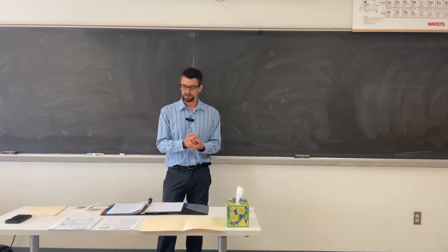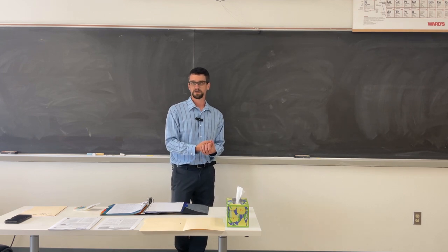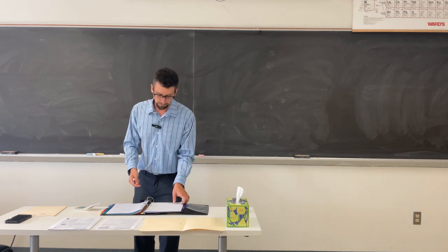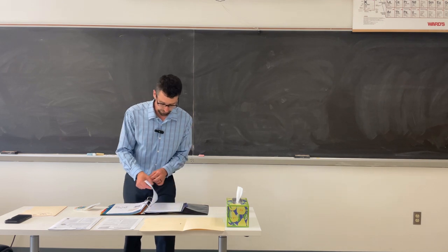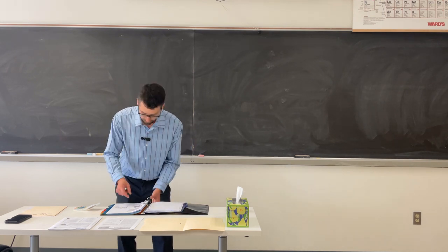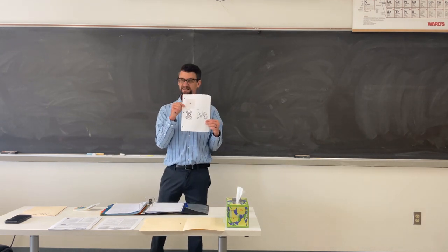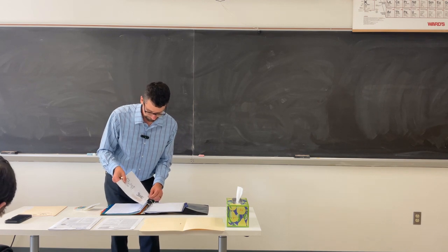And then we're going to get into what's known as atomic scattering or atomic form factors. I'll explain what that all means in a little bit, but for now, let's just talk about the experiment, and we will go back. The other thing is this picture. Do you guys have that still? If you do, grab that. We're going to talk about it in a little bit, okay?